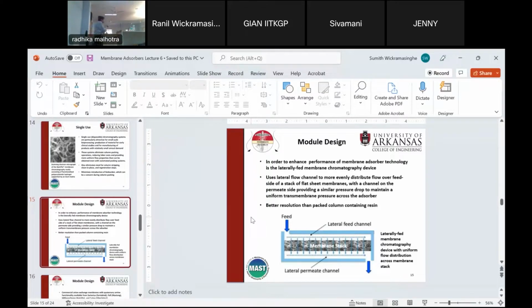And the thought is that these are due to geometrical effects. So in the membrane, you might have multiple ligands attaching to the same species, same product, solute, whatever, and that makes it more difficult to release. But this has been observed. That's another problem.